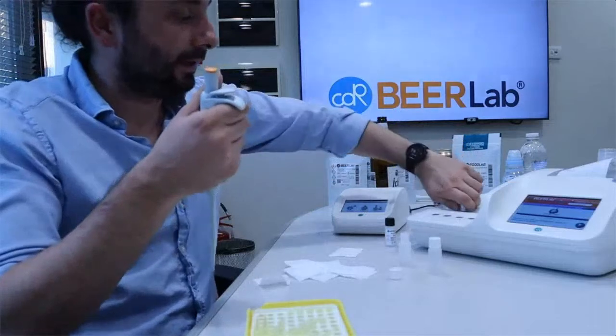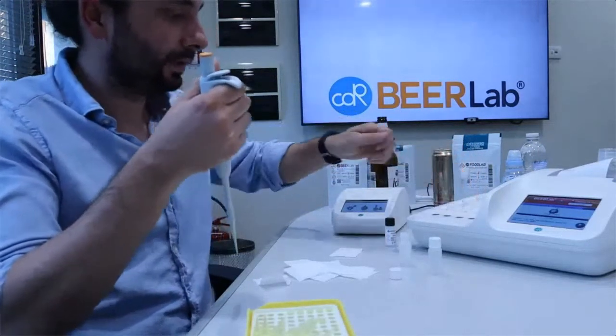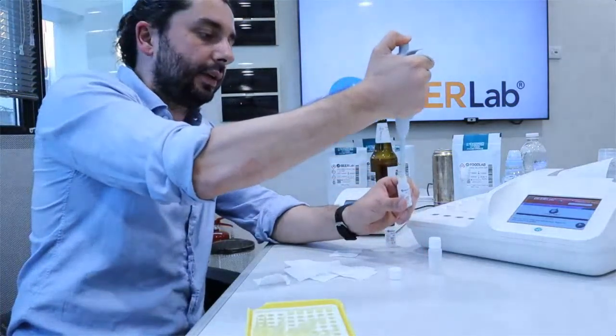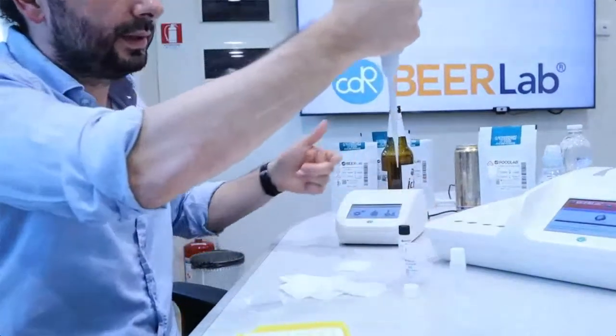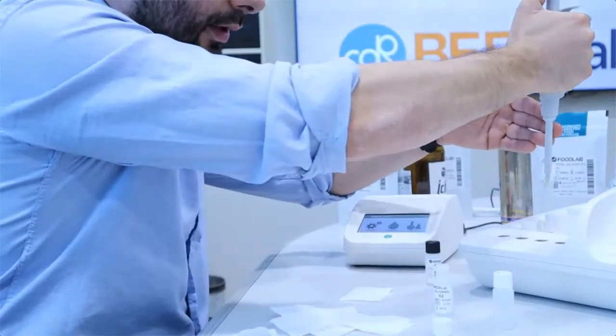We take back the cuvette into the incubation part, and here we take 50 microliters, and we add the 50 microliters into the cuvette.